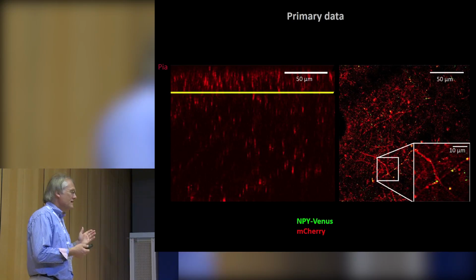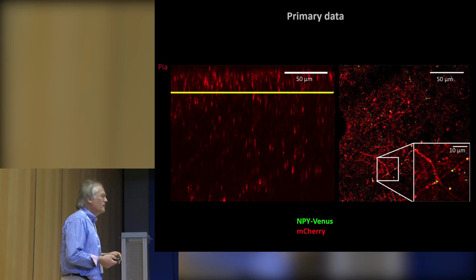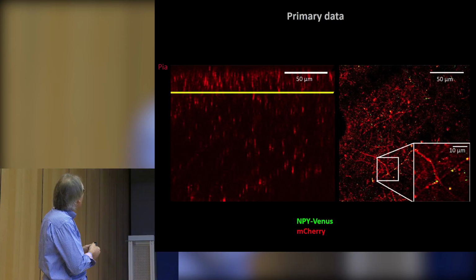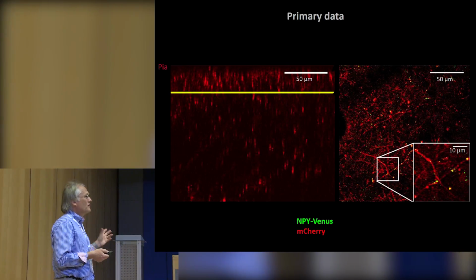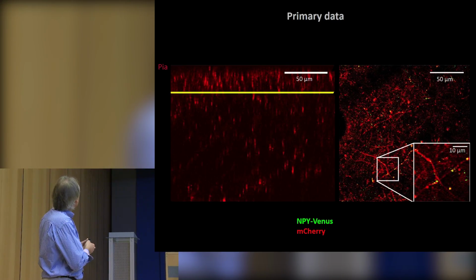So this is an example that is sort of probably the best one that we could obtain in all these imaging sessions. What you see here is an axon that runs like this, and you see this synaptic bouton here, presynaptic bouton. Then there's other axons also here, and then there are some green vesicles where we didn't get the axon stained. That can of course happen, that you don't get 100% co-expression of the 2 things. So that's why there is also some green vesicles. So now let's look at this.